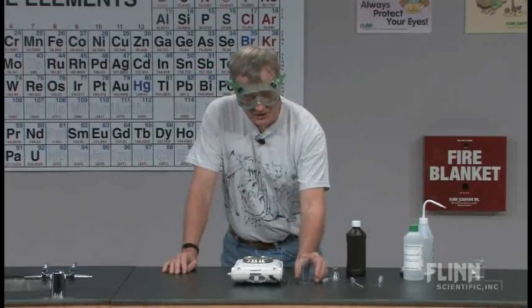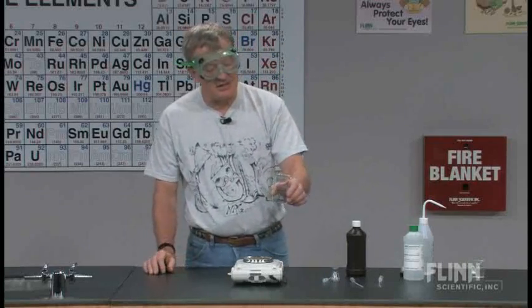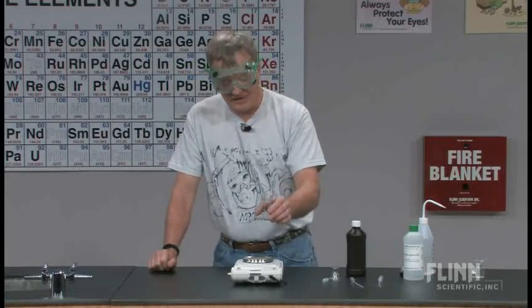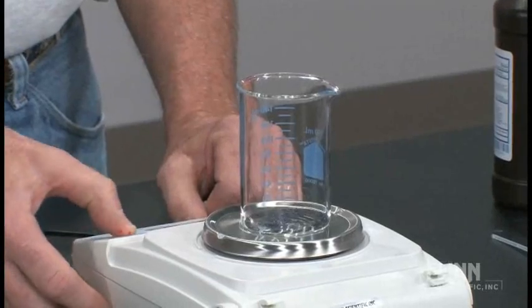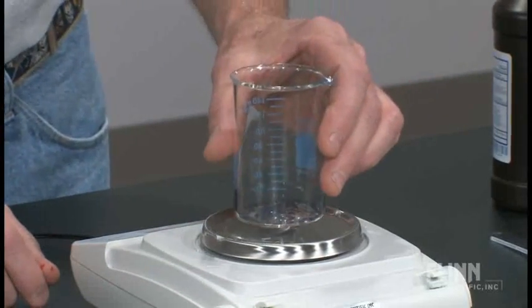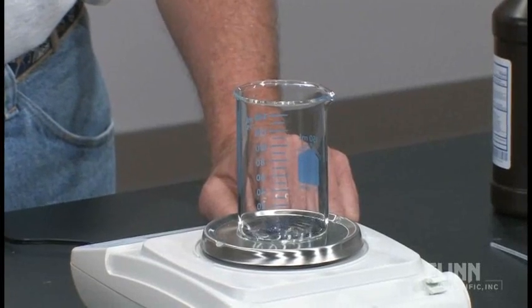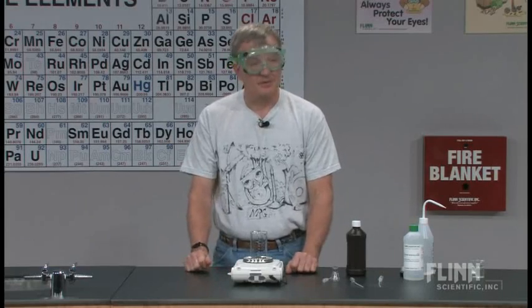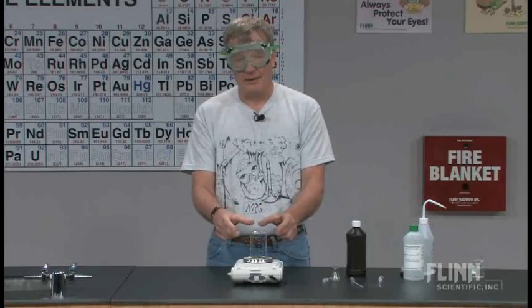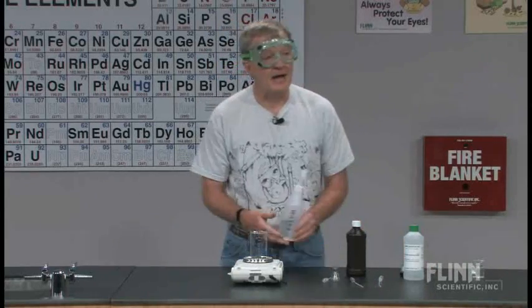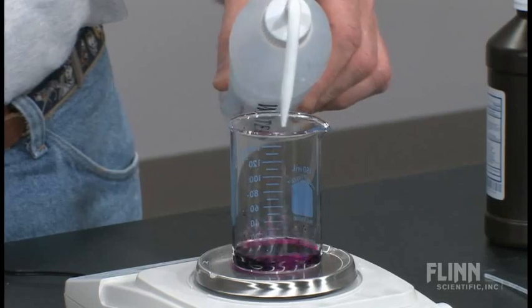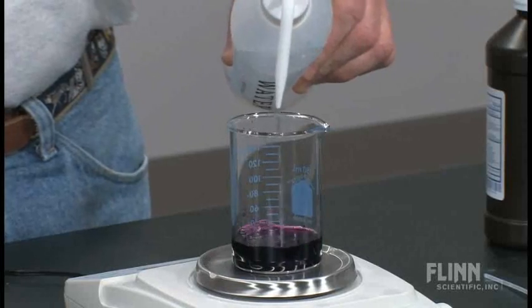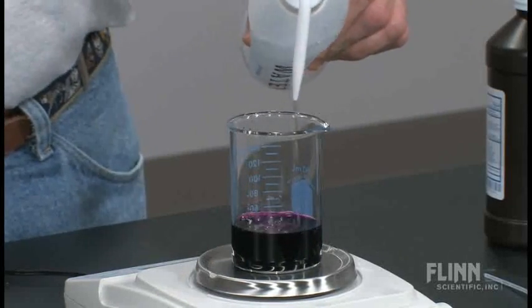What I've done ahead of time is I've already weighed out and placed into this beaker 1.58 grams of potassium permanganate. I'm going to turn the balance on first, set that on top of the balance, and zero it out. I now have in here 1.58 grams of potassium permanganate. I am going to add to that 100 milliliters of water. I honestly don't care if it's 100 milliliters exactly. I'm just going to add some water to it. I'm going to use the graduations on the side of the beaker because the accuracy here is irrelevant.